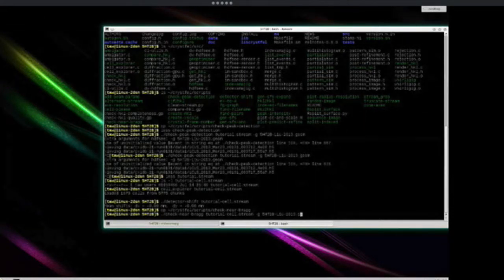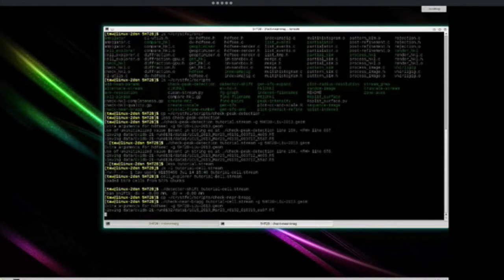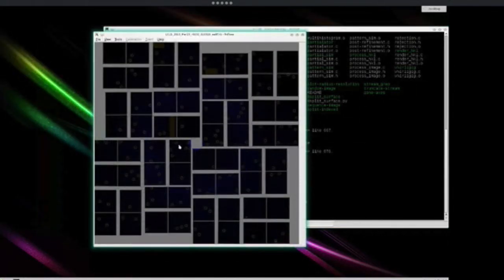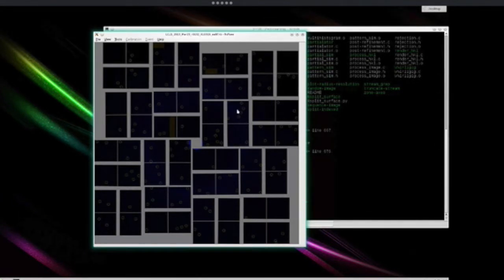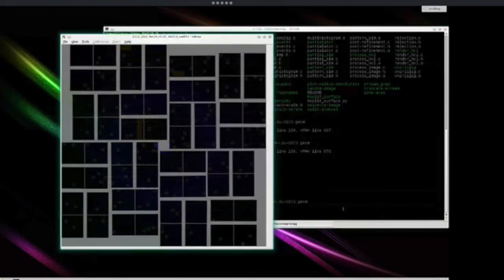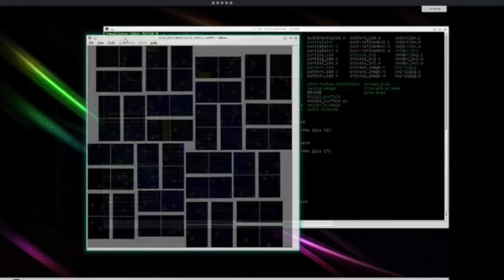Because all that does is affect what I see on the screen. So the peaks will appear in the correct location relative to the image data. So these circle locations will always match the underlying data, but the panels themselves, so the whole thing, will be offset on the screen. But that's not a problem in this case, because all we want to do is look at how well those circles agree with where the real Bragg peaks are. And I should mention, I could also have put that -g option inside the check near Bragg script itself. Remember, you're supposed to edit these scripts to customize them to fit your needs a bit better.